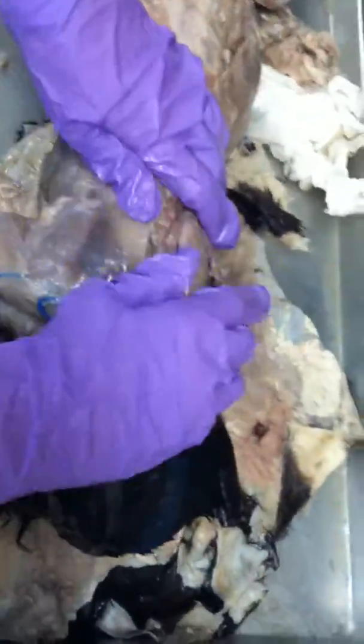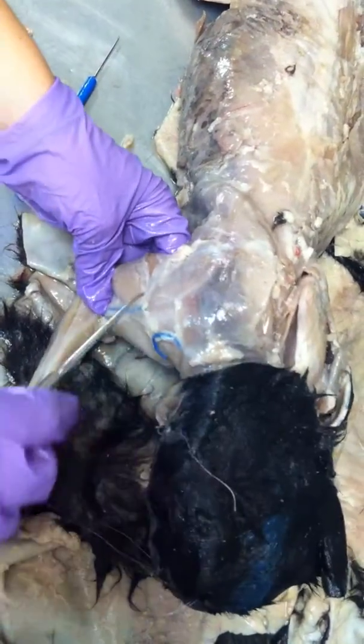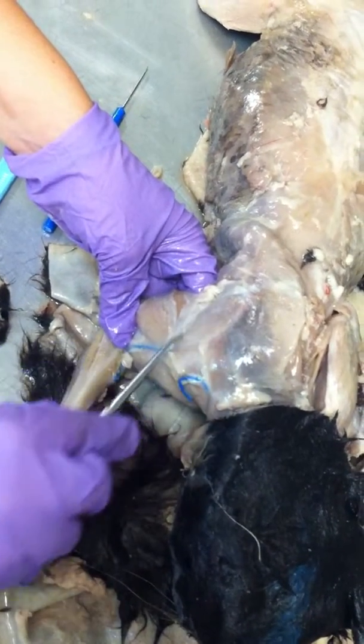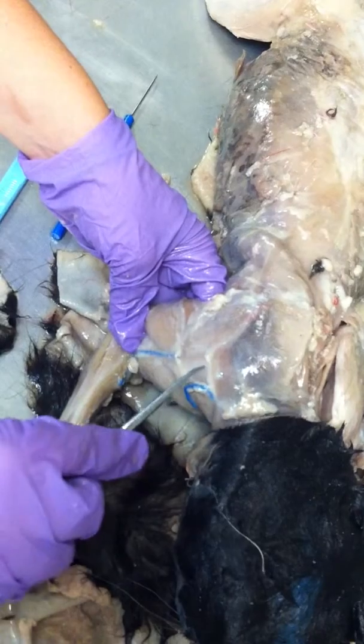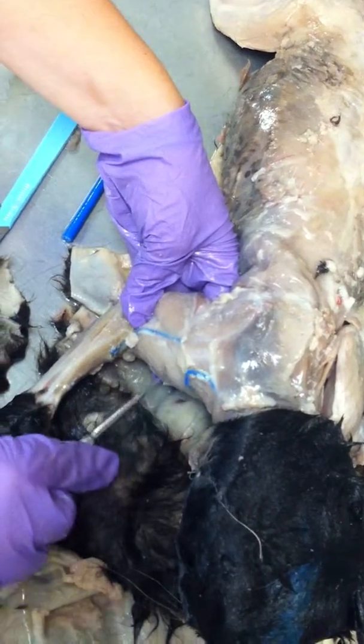Oh, actually. Nope. Sorry. Looking at the superficial muscles of the shoulder, in humans we only have one deltoid and one trapezius. In the cat, they have 3 of each. So this is the spine of the scapula. This is the spinodeltoid muscle running with the spine of the scapula. At the end of the spine, you have the acromion process. So this is the acromiodeltoid. And then right here would be the clavodeltoid.